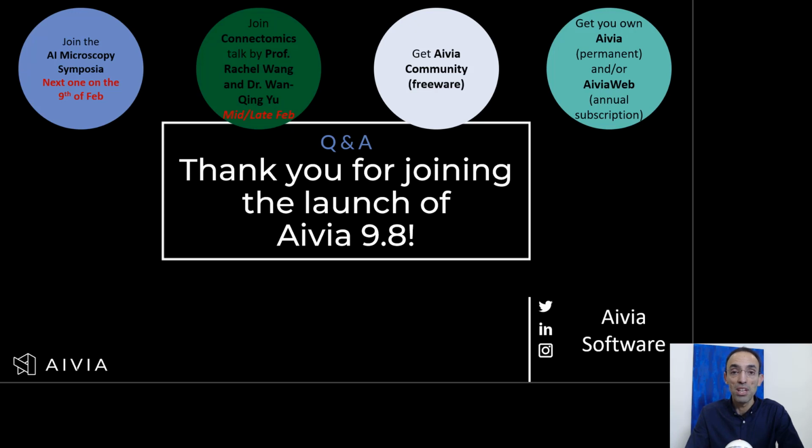So this time around, we will have 3 outstanding speakers. You can go on our website and check it out right now. You can also search on Google AI Microscopy Symposia, and you'll find it. This symposia is coordinated between us at Aivia, the Aivia team, at the Aivia software, and with Leica Microsystems. So thank you also to Leica for their collaboration on this organization of this symposium.